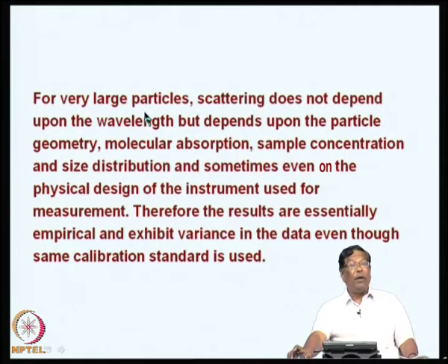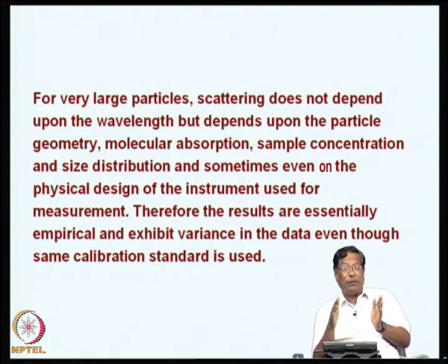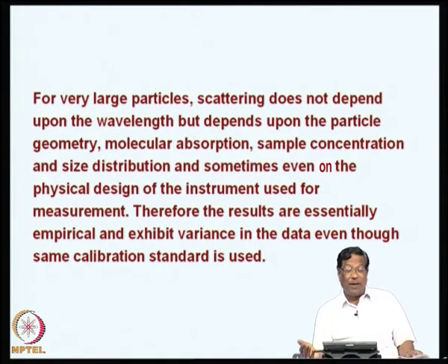Suppose you have still larger particles, very large particles, then what happens? Scattering does not depend upon the wavelength, but it depends upon the particle geometry and molecular absorption, and then sample concentration and size distribution, and sometimes even the physical design of the instrument keeps on changing the absorbance measurement.